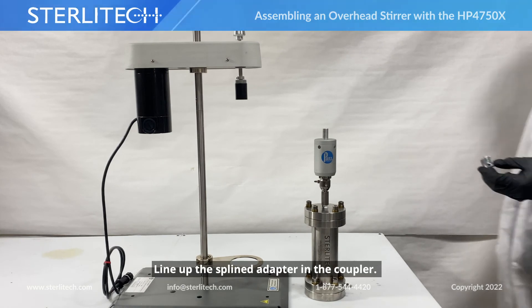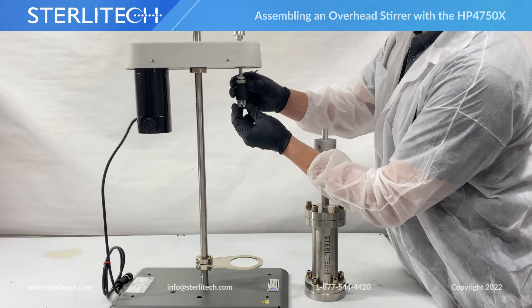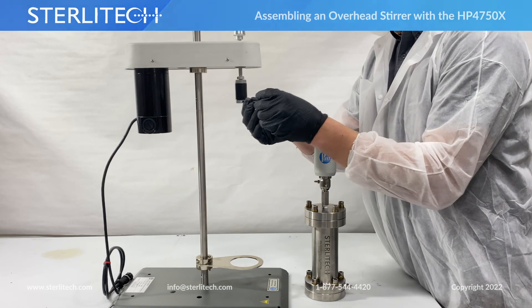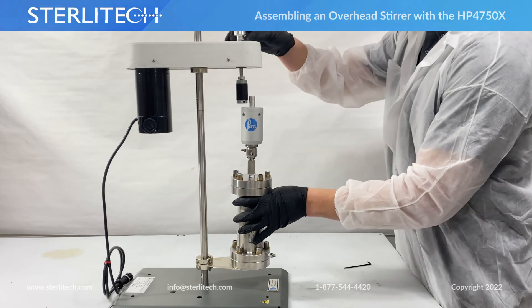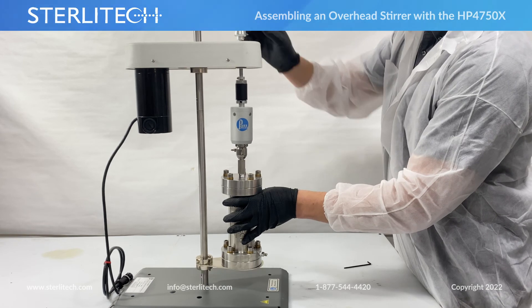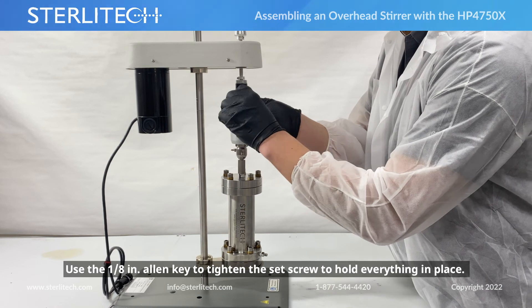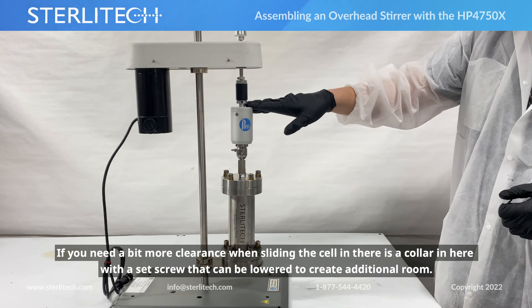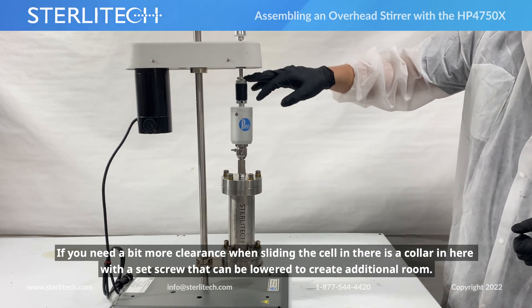Next, we're going to take a splined adapter, line it up, and press it into the coupler. Before we install our cell, we're going to loosen the set screw on the coupler, then gently lift your cell onto the stand. Lift the knob on top to create some clearance, slide it under, and slide it back down. Using the same 1/8" allen key, tighten the set screw to hold everything in place. If you need more clearance when sliding this in, there is a collar with a set screw — you can lower that for a little more room.